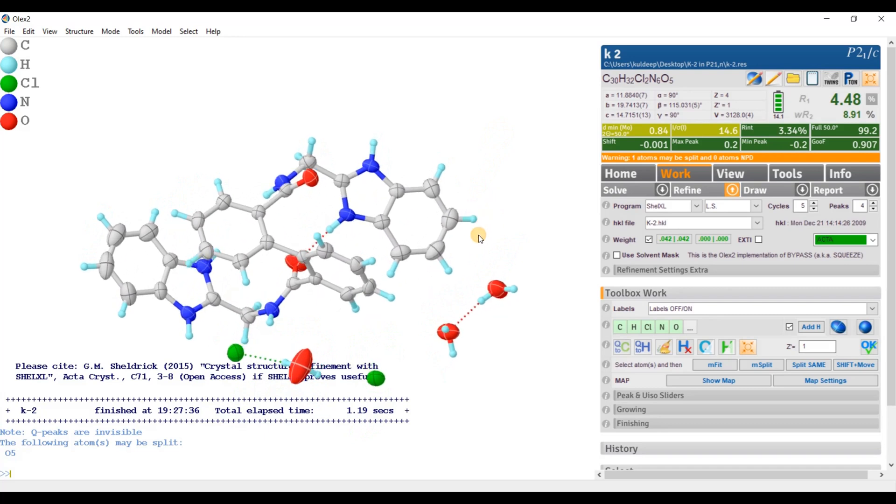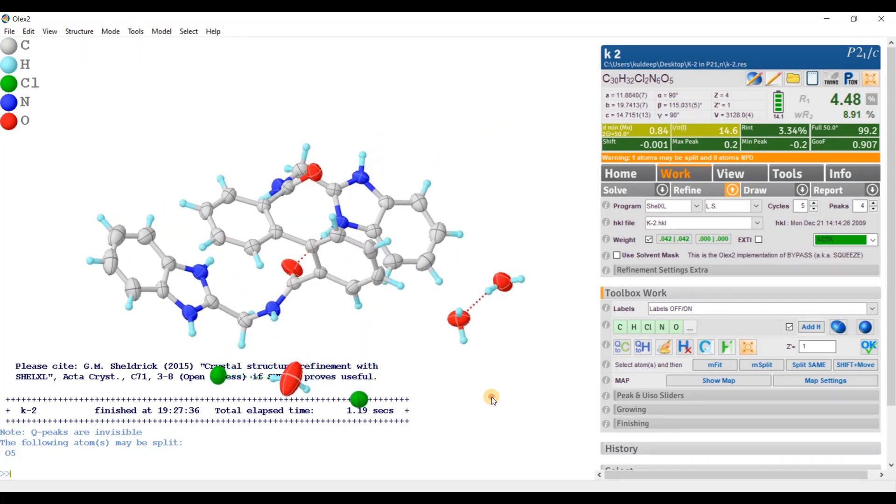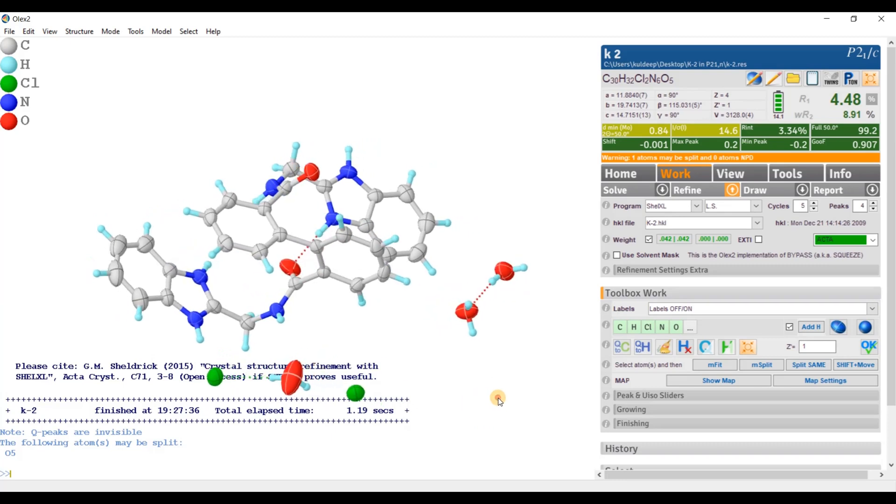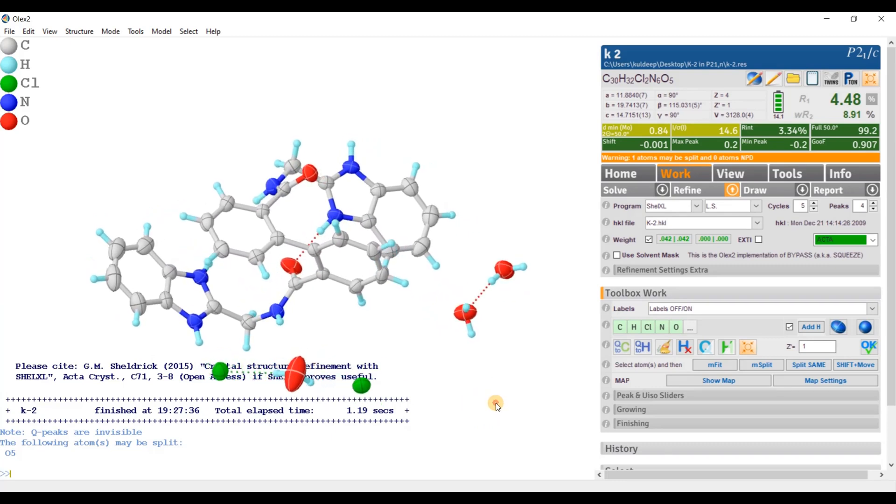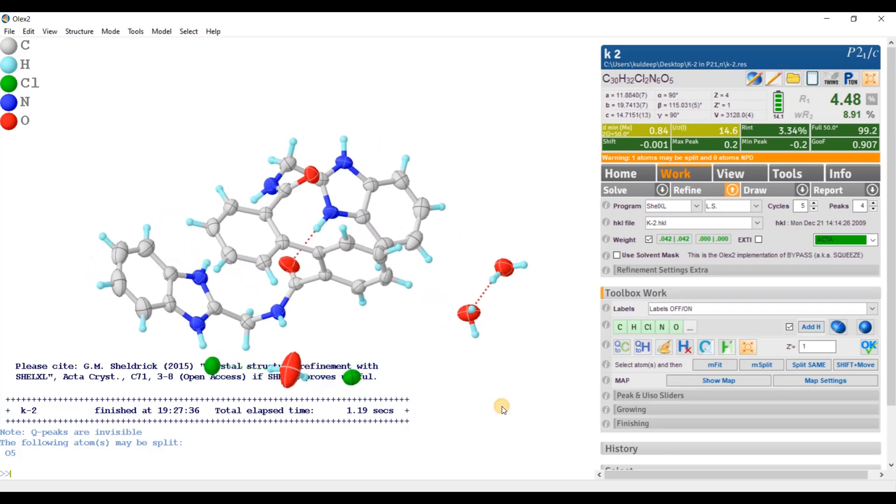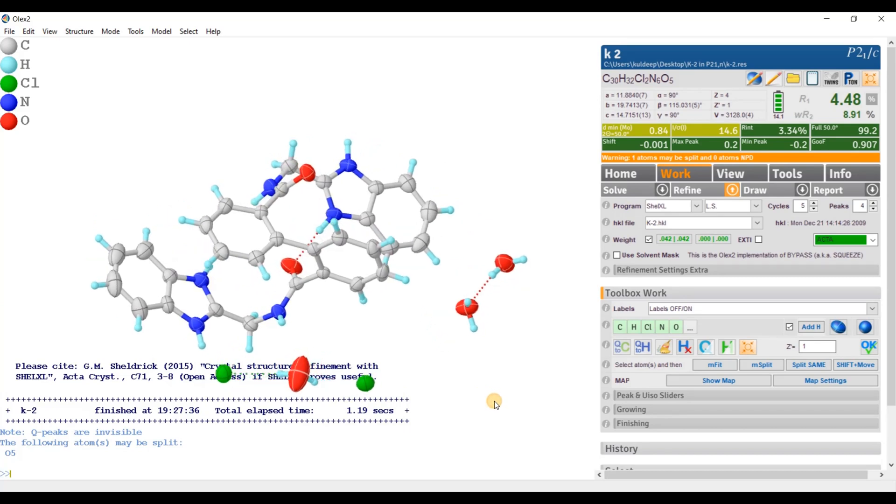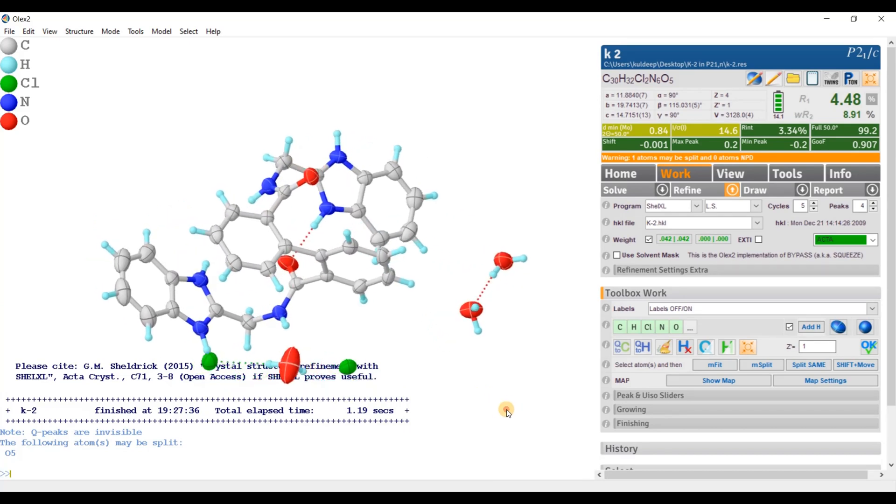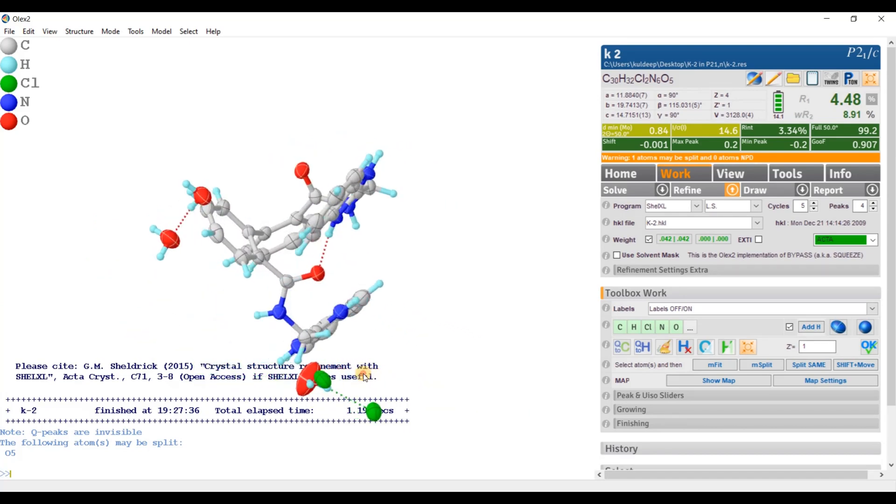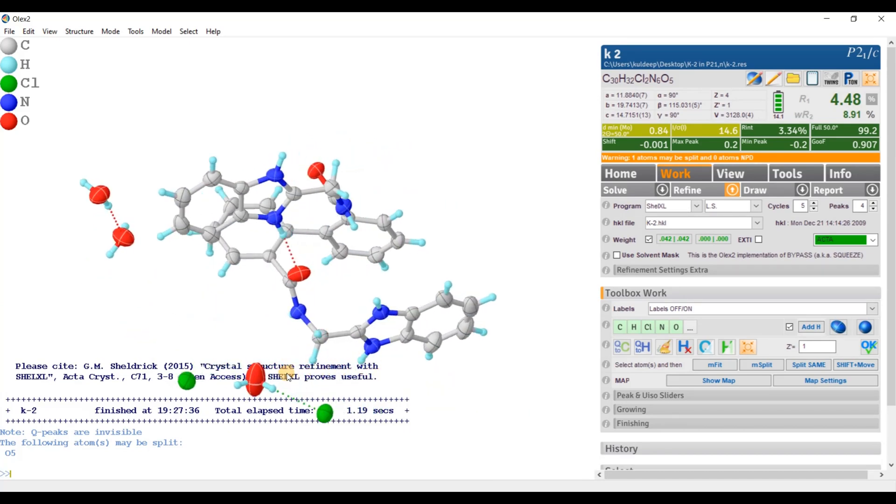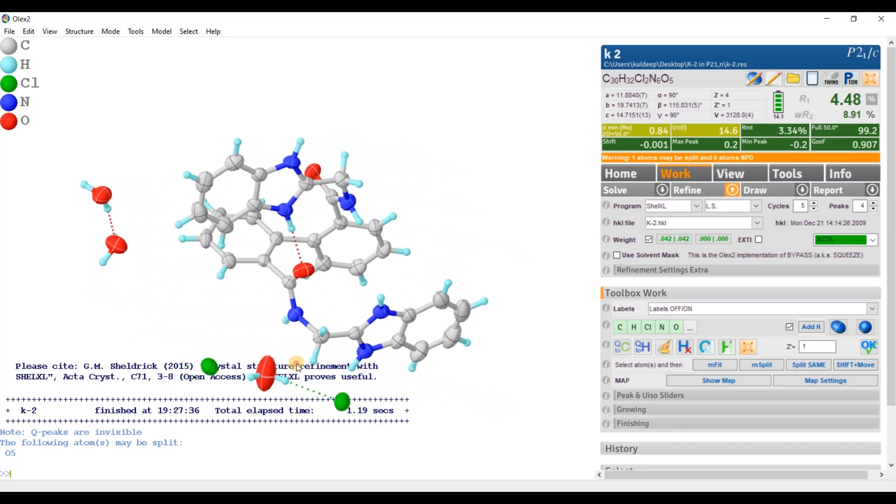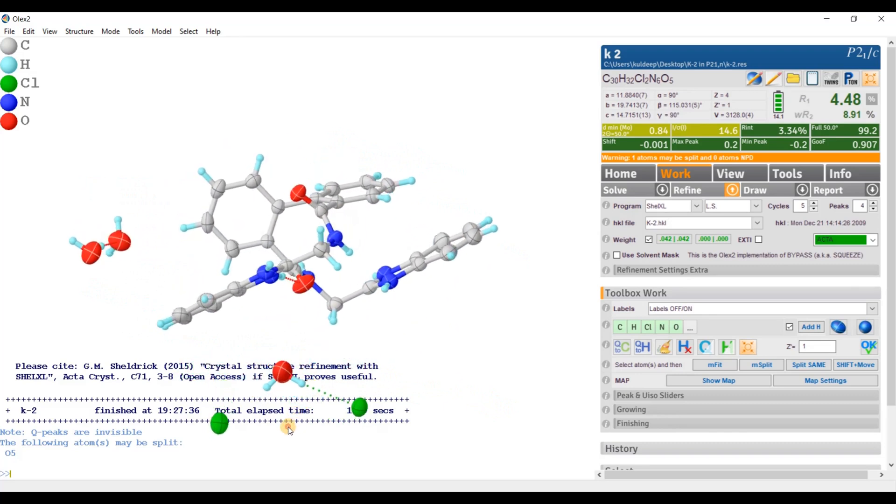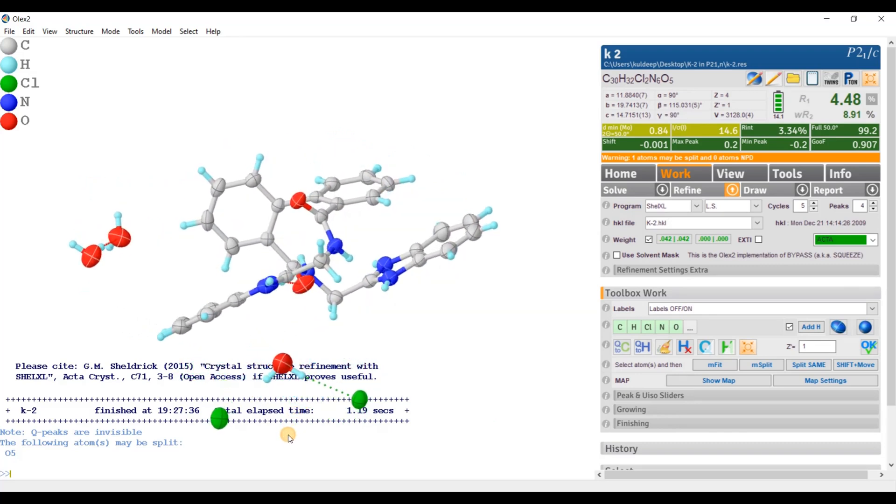Okay. Now come to the second point. Second point of the tutorial: by using the AdSym again to find out the missed symmetry. I am taking an example of molecule in space group CC.